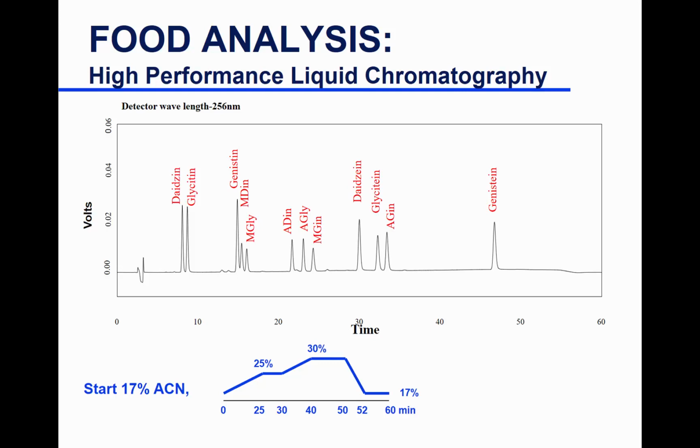Instead of increasing the acetonitrile as it goes on, you could pause it maybe after the 35-minute mark. Well, if you pause it, this will take longer to come out. Oh, increase it. Yeah, you would up the acetonitrile. Exactly.